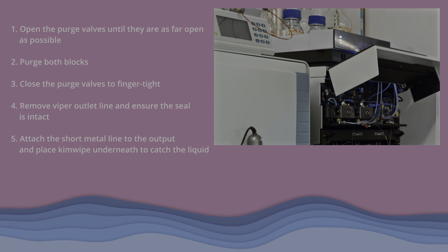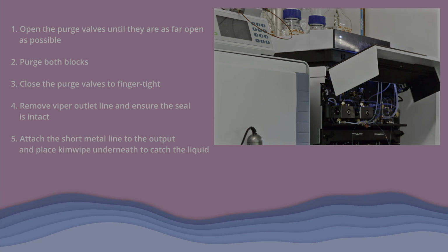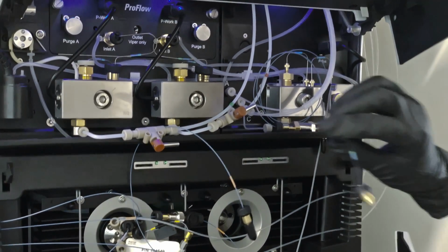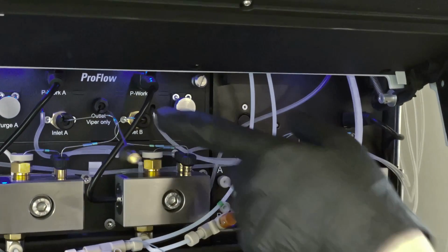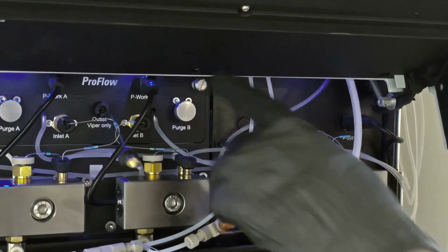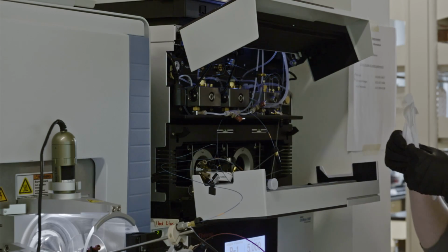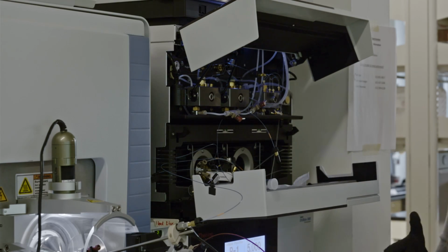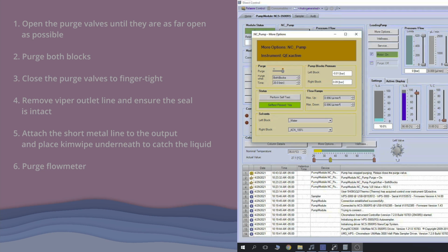So the purge that we're going to do next is to purge the flow meter, which is the space back behind here where the solvents are mixed. And to do this, flow will come out of this outlet. So we'll install this stainless steel line here to ensure that no solvent will drip down into the electronics of the pump. Once that's there, we'll place a Kim wipe underneath it to collect any solvent that flows out during the purge, and we'll head over to the instrument computer to start the purge.